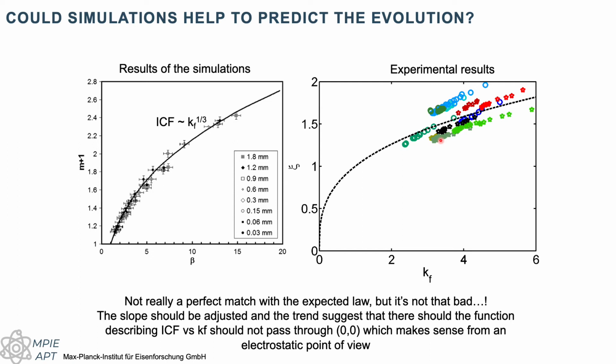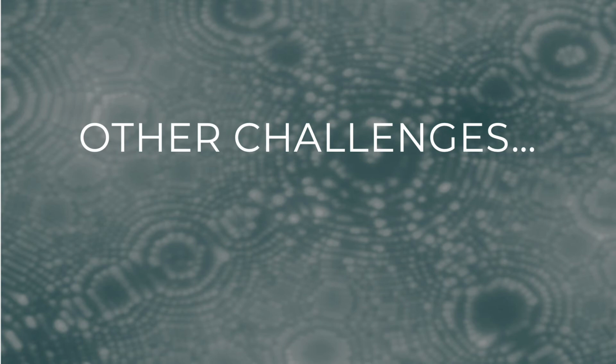But all of these parameters are interlinked because they are related to the geometry of the needle. Yet at the end of the day, for now, it's not really straightforward to predict what the real and actual values should be. Right, so for now, we've looked at mesoscopic issues associated with the reconstruction. And there are many other challenges, which I'm going to discuss right after.